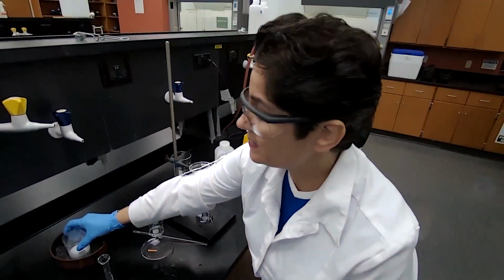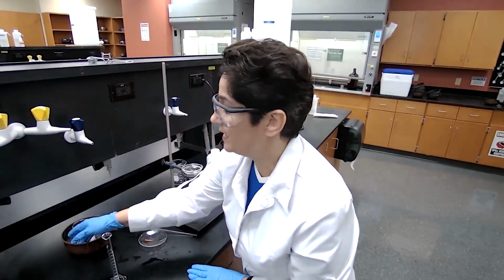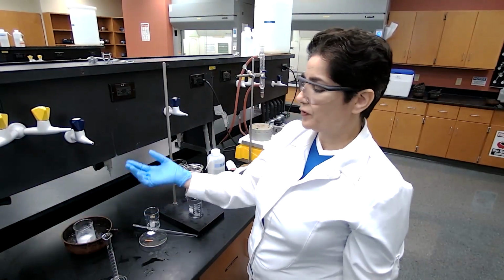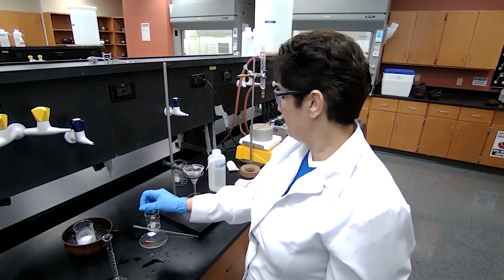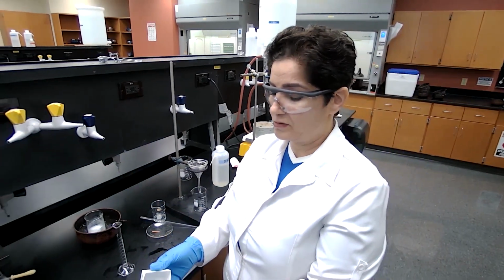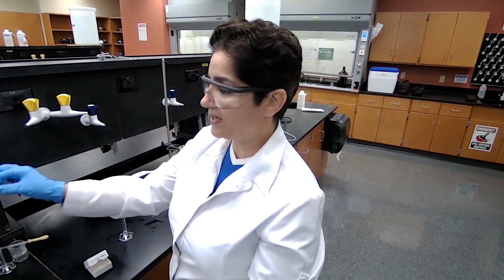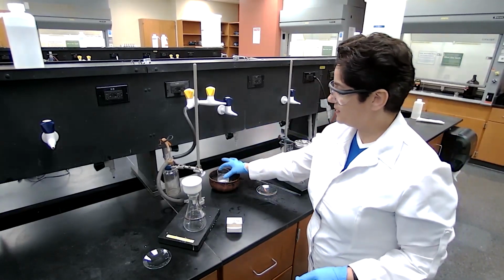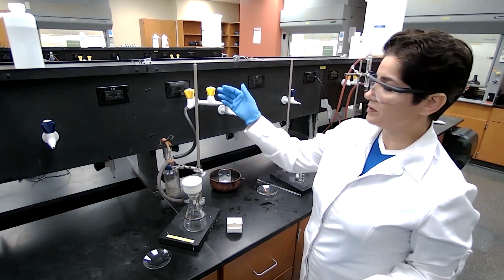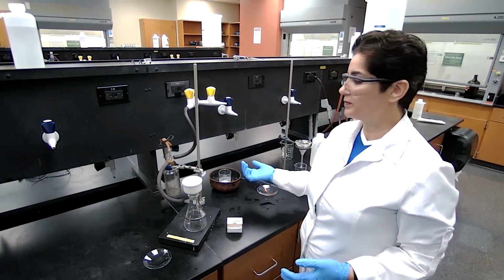I place it in an ice bath for complete precipitation. I usually do this for about 5 minutes to make sure that the mixture is cold enough. After the 5 minutes of cooling, we would vacuum filter. We are going to separate the crystals that have formed already using a vacuum filtration apparatus.